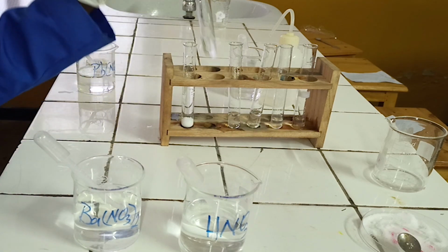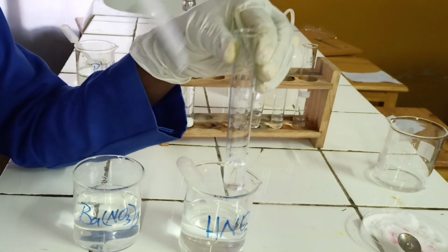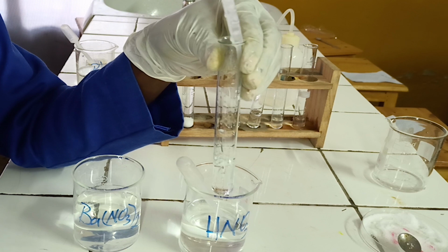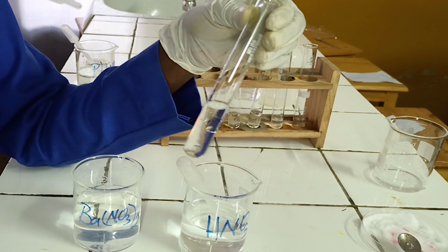To the second test tube, add barium nitrate solution. As you see, barium nitrate doesn't react with chloride ion.